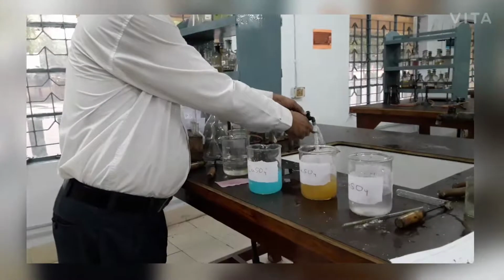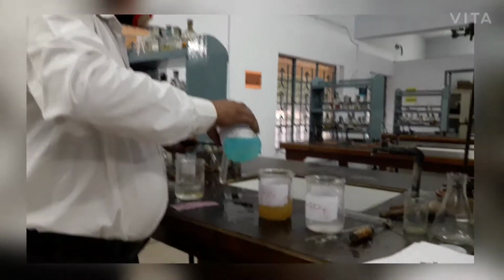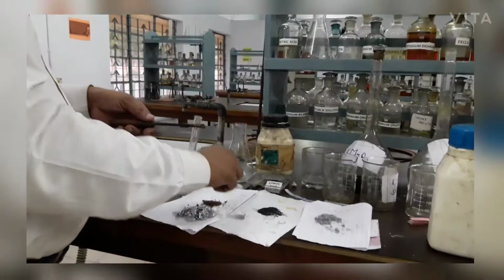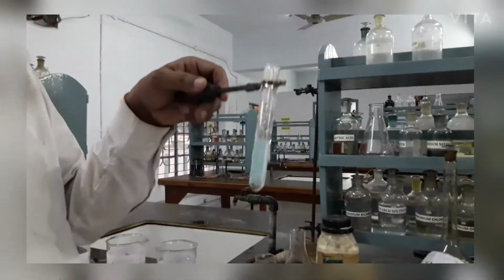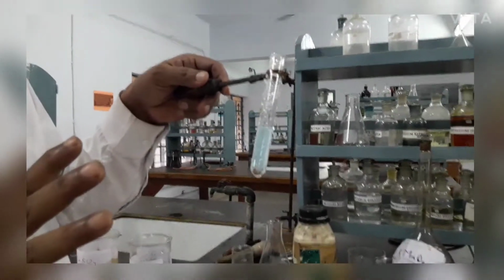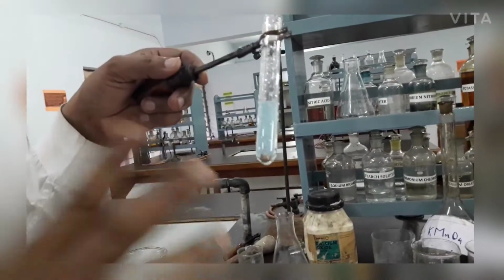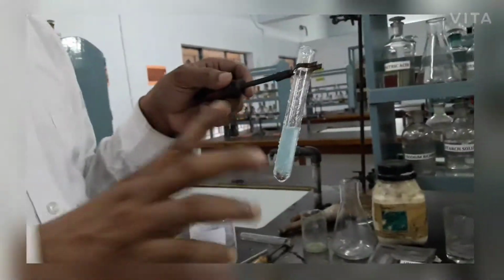Now again we are taking copper sulfate and we add copper turnings. We wait for the reaction. We see that there is no reaction. Of course, no reaction means copper cannot react with copper sulfate.